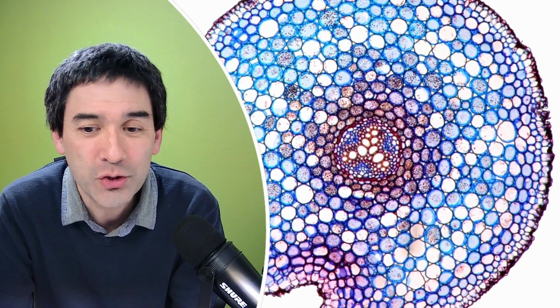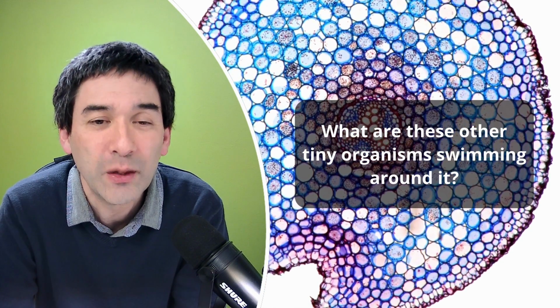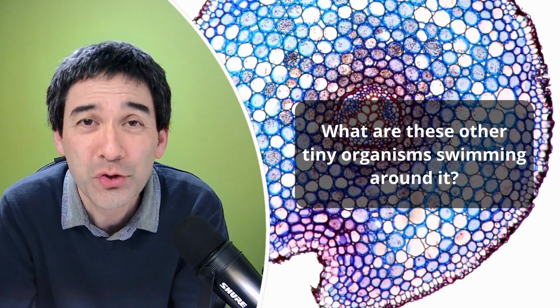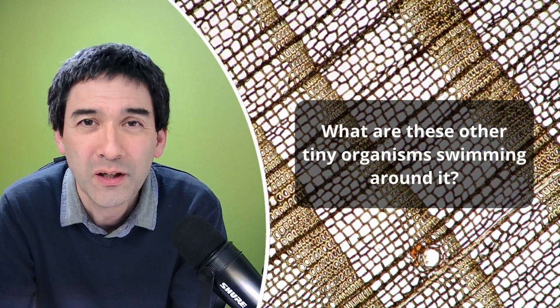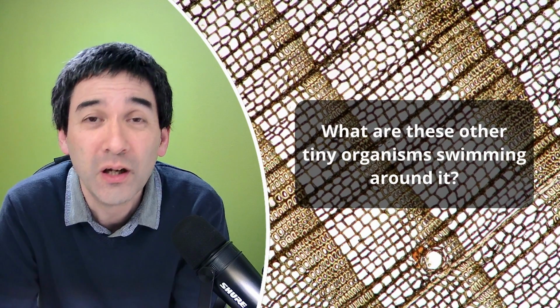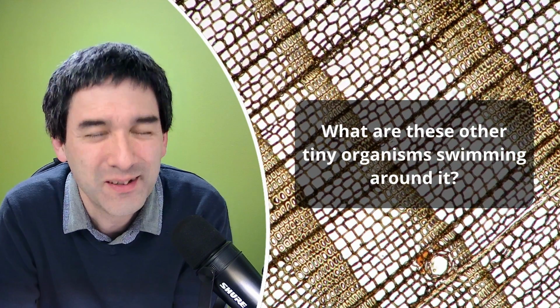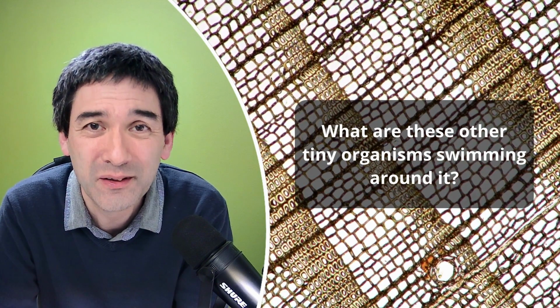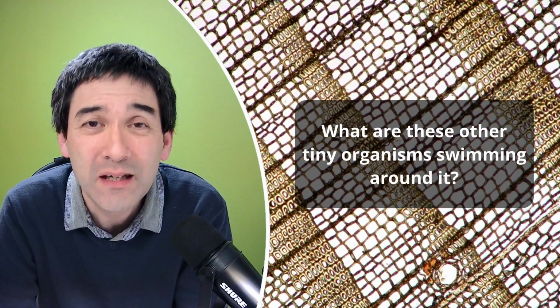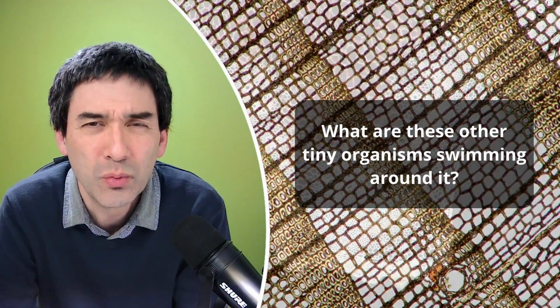So the next question is now the following: what are these other tiny organisms swimming around? And this question refers to one of the videos that I made, I think it was the video about Stentor, which is also known as the so-called trumpet animalcule. It's not an animal, it's a protist, side issue, right? But in this sample, there was not only the Stentor, but there were also many other microorganisms floating around. And the question is now, what are they actually?